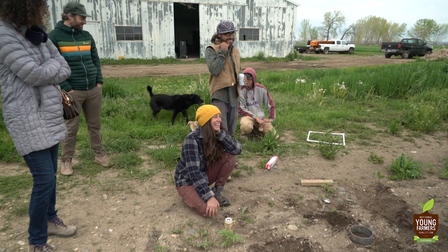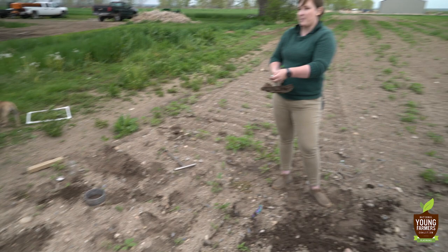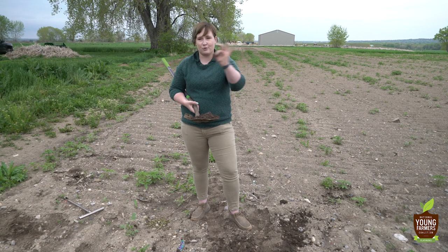So you can just break them up when you put them into your bucket, break them up when you put them out to dry. It's also a lot easier to get the sample completely mixed together if you're not trying to mix two marble-sized clumps of clay together.